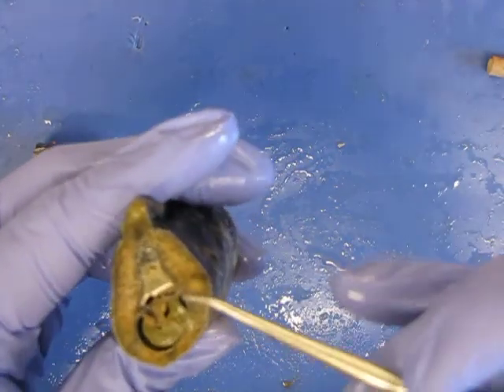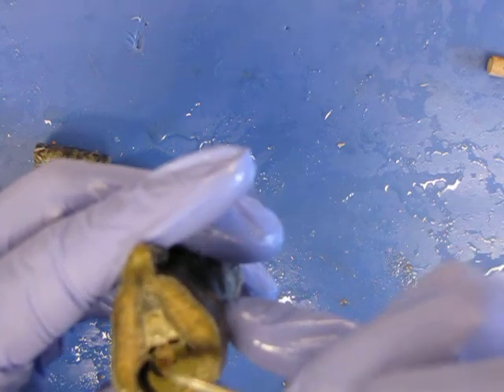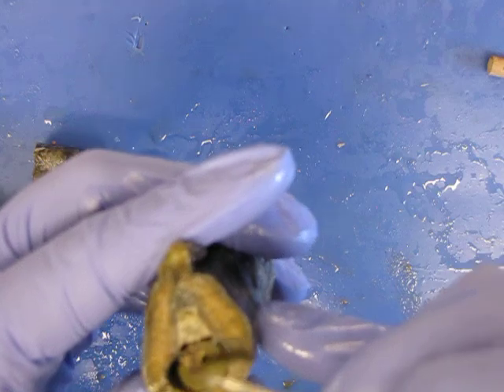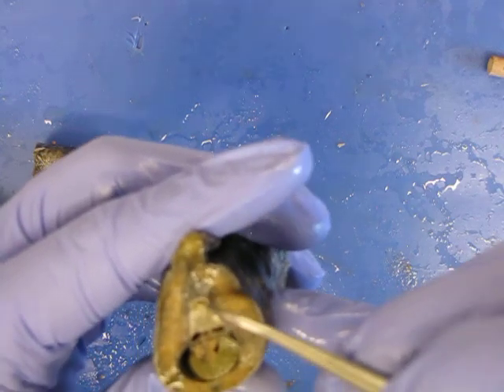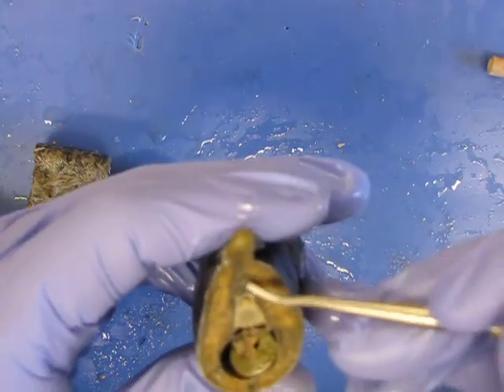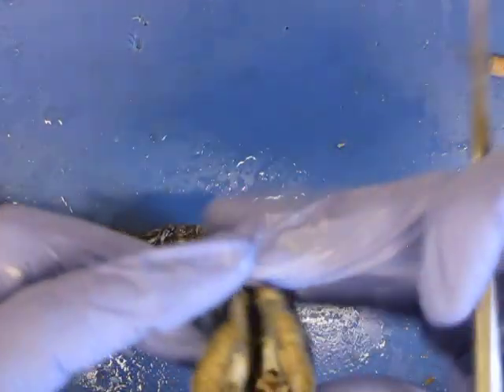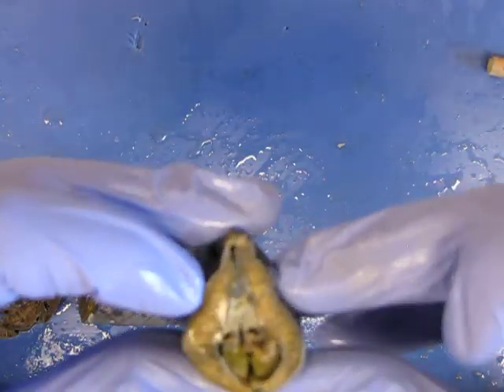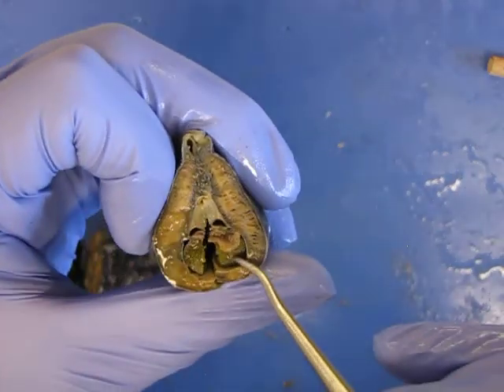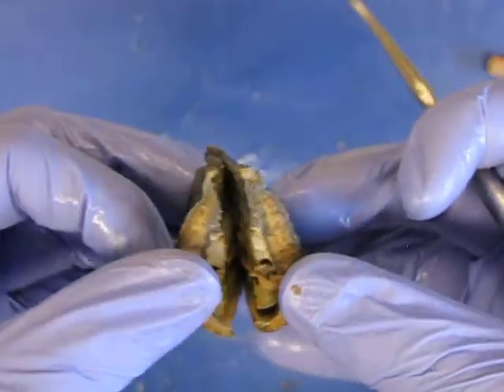The other side, liver starting to become less prominent. Blood vessel, intestine, blood vessels, intestine, liver, notochord, spinal cord, hematopoietic tissue starts to become pretty darn distinct there. And this is one that I did a sagittal section addition too. So at this point, the liver's getting smaller, but you can still clearly make it out. This is the testicular tissue starting here.